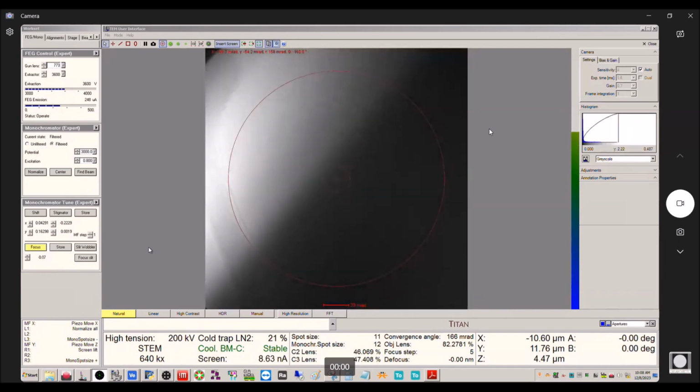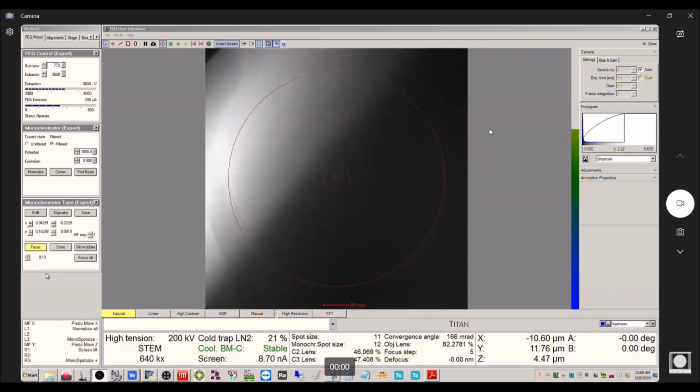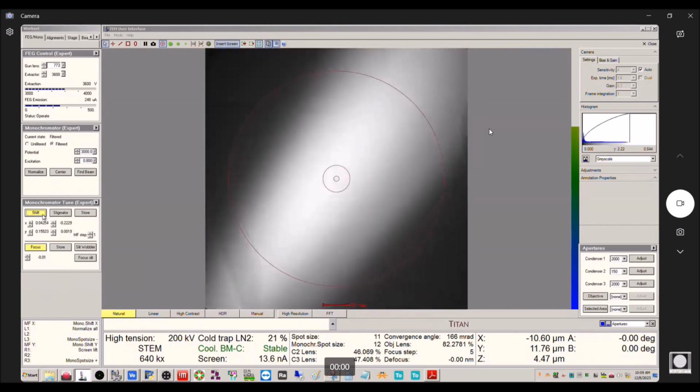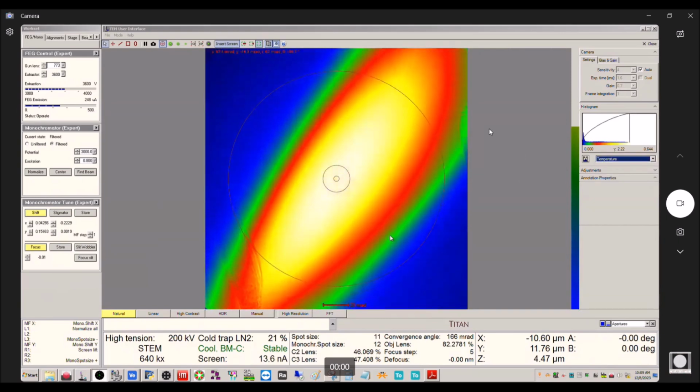and what you're trying to get is this 0 point here, okay, that you had before. Okay, now you're not trying to actually focus it on the screen here, okay? You're not trying to get this, right? This is not what you want. Okay, you want this at the 0 point that we established previously, okay? All right, so then we can shift, so we can see what's going on here.